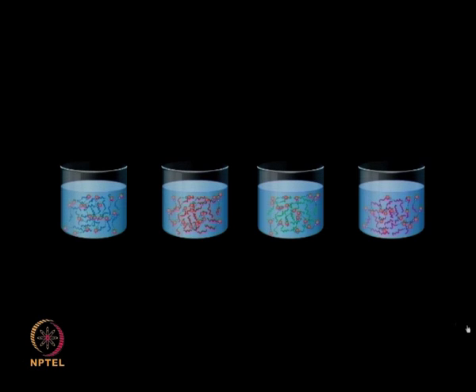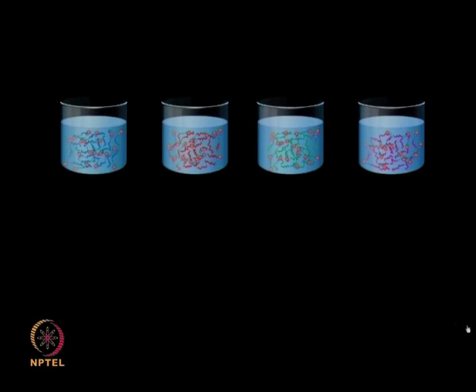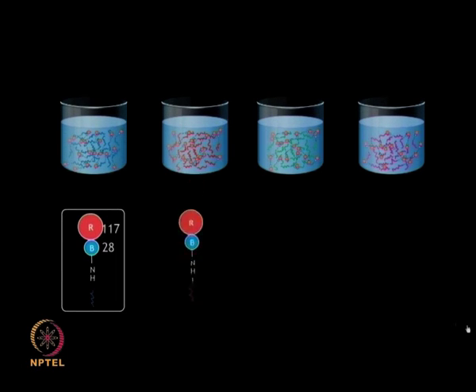The reporter group used to label each peptide sample is unique, and the masses vary between 114 to 117, thereby enabling the labeling and quantification of up to 4 samples simultaneously.